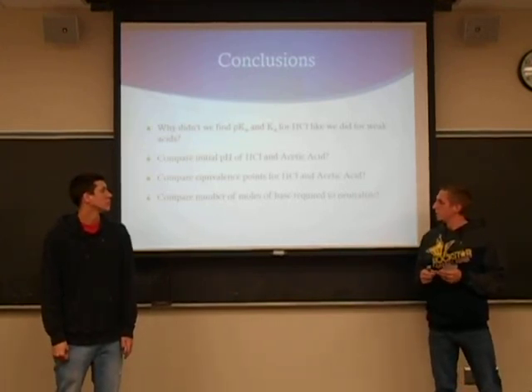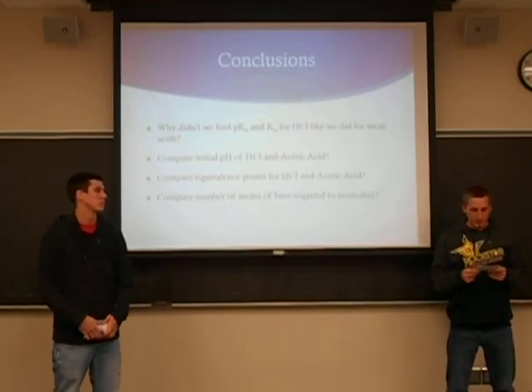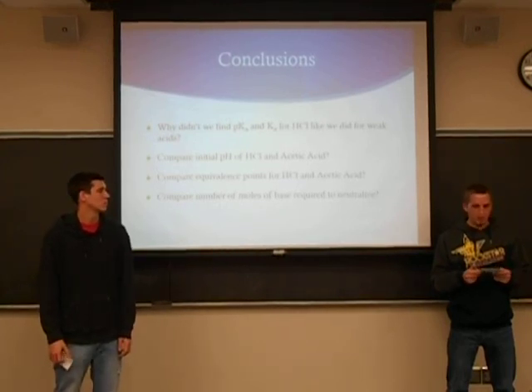And comparing the number of moles required to neutralize, the hydrochloric acid needed less base to neutralize it because it had a lower concentration than the acetic acid. The hydrochloric acid was 1 mole and the acetic acid was 1.2 moles.